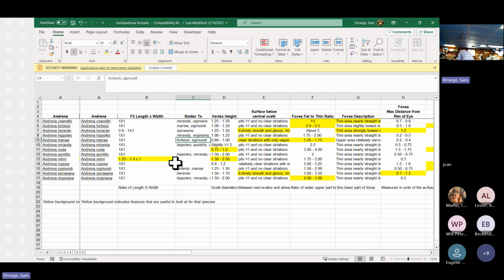Let's see if I can find it. Because of this in-between nature of having a dark abdomen sometimes and a red abdomen other times, it's something that can trick you up, particularly if you're in an area where you have a lot of the red abdomen action. So I do have a red abdomen one here. I'm going to bring it out to show what that looks like.